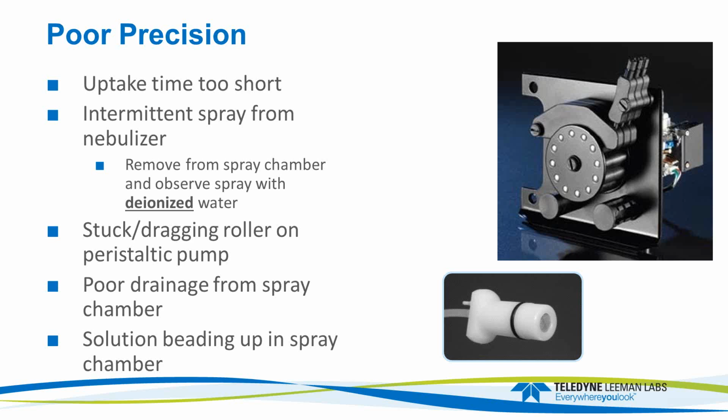So that's one approach, is to clean that spray chamber. There are reagents available that you can run through a spray chamber to clean it up. Some people will use like a 1% HF solution through a spray chamber just for a short period of time, and that'll clean it up pretty good. There are some other reagents that are safer. It's something from Fluka, RB25 from Fluka is a thing you can get. I think that's the right description of it. I like that stuff. I prefer that over the HF, of course. It works pretty well. Clean up that spray chamber. Okay.